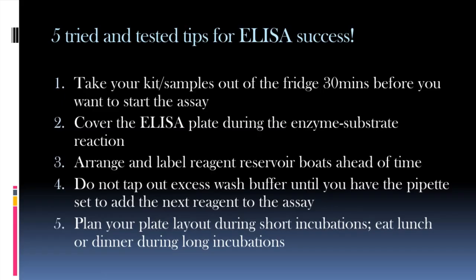Fourth is, again, going back to the wash buffer, you do want to tap out all of the excess wash buffer before your next step, but you don't want your plate to dry out. And so it's important not to tap out that excess wash buffer until you have everything set to add the next reagent to the assay.